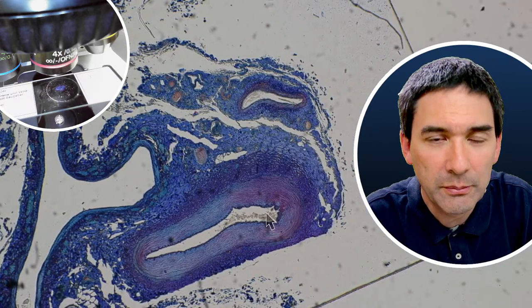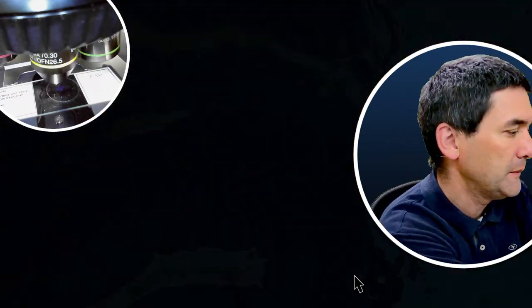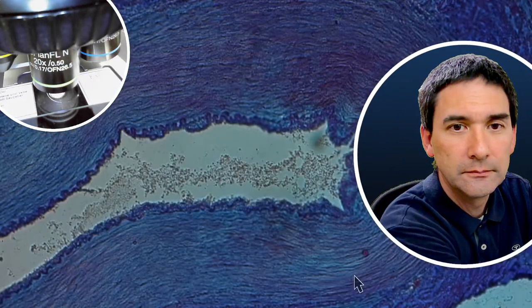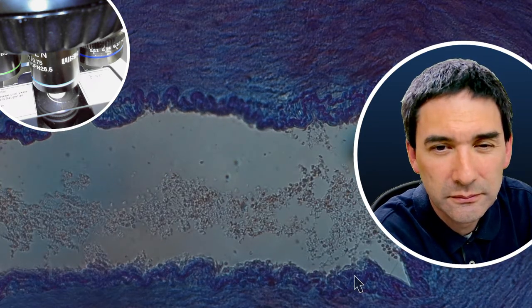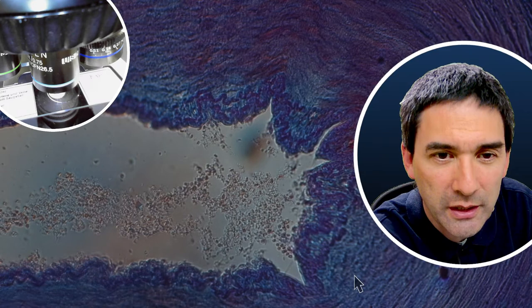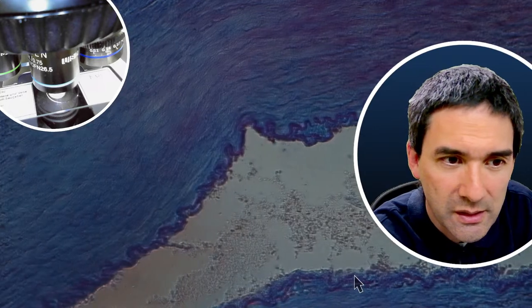Maybe we're able to see some of the red blood cells in here, by going a little bit further with the magnification. Always recenter. And here again. Honestly, this looks pretty deformed. I can imagine that maybe during the processing the cells were kind of destroyed, but I do not see the very nice round structure of the red blood cells.